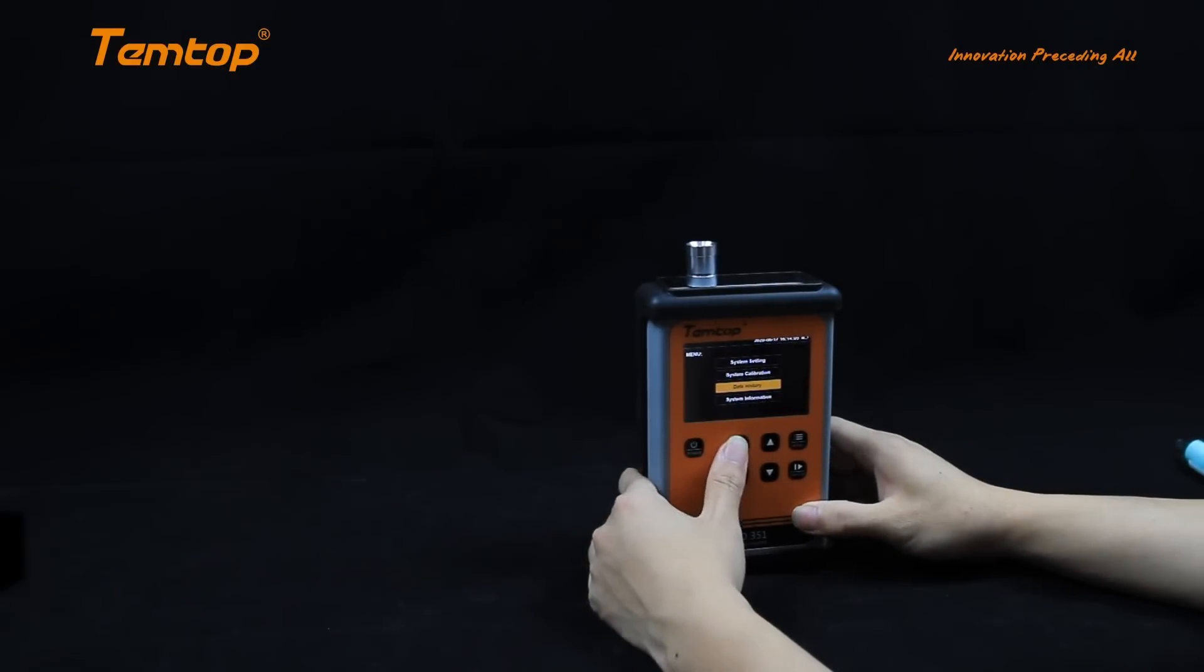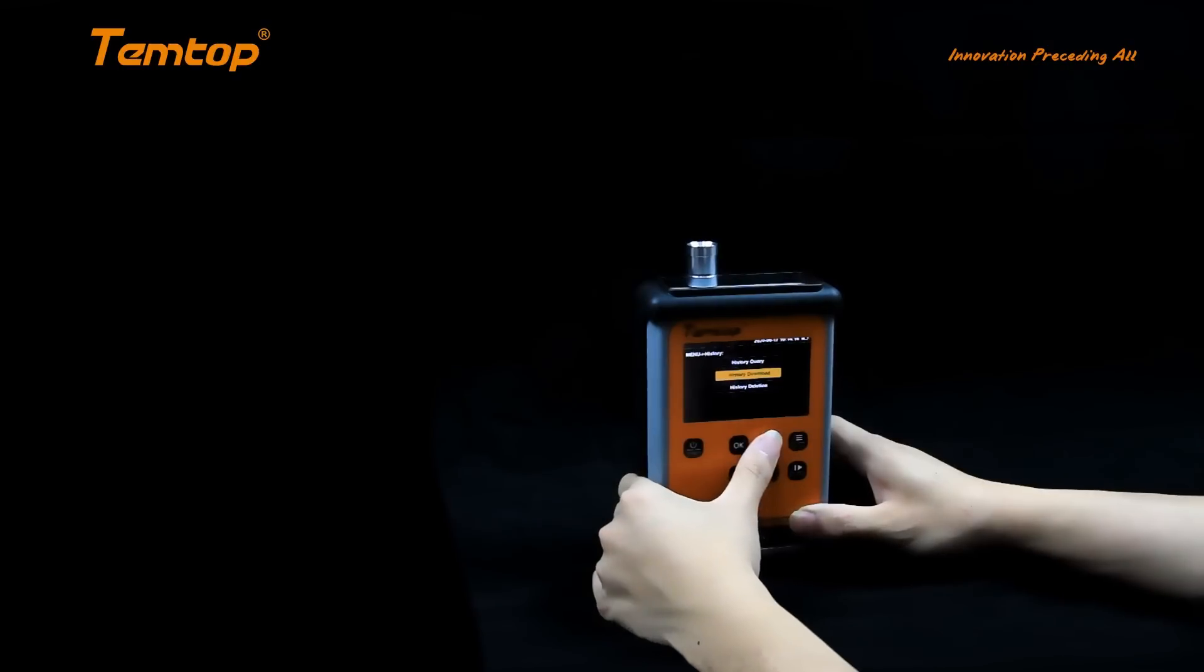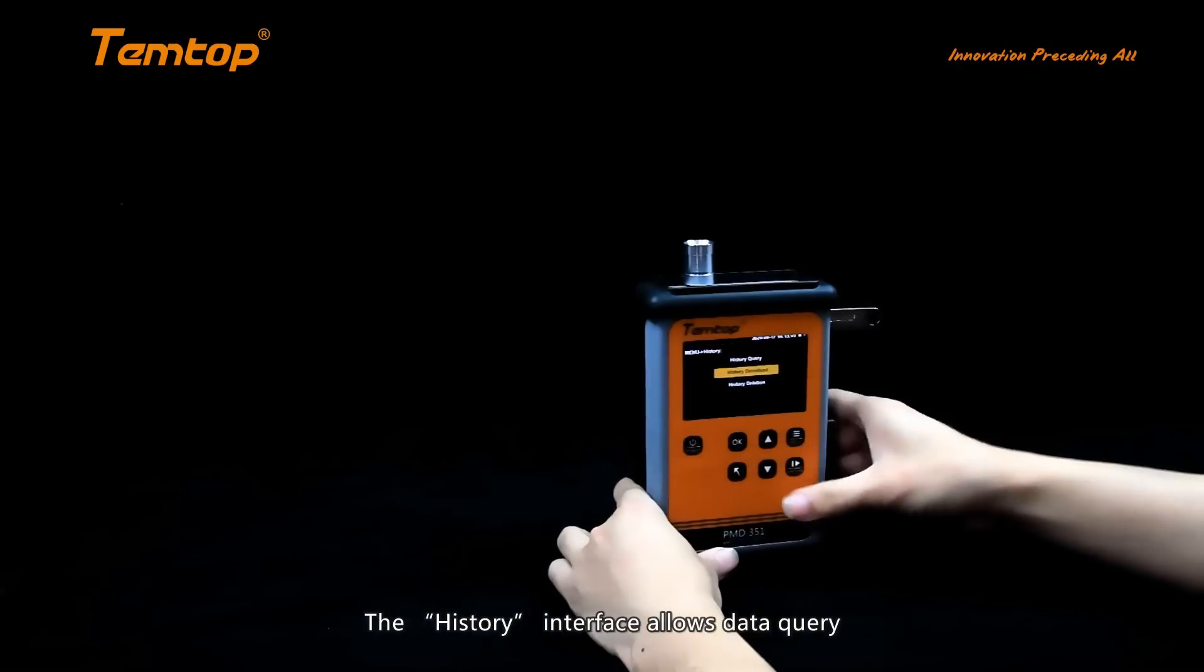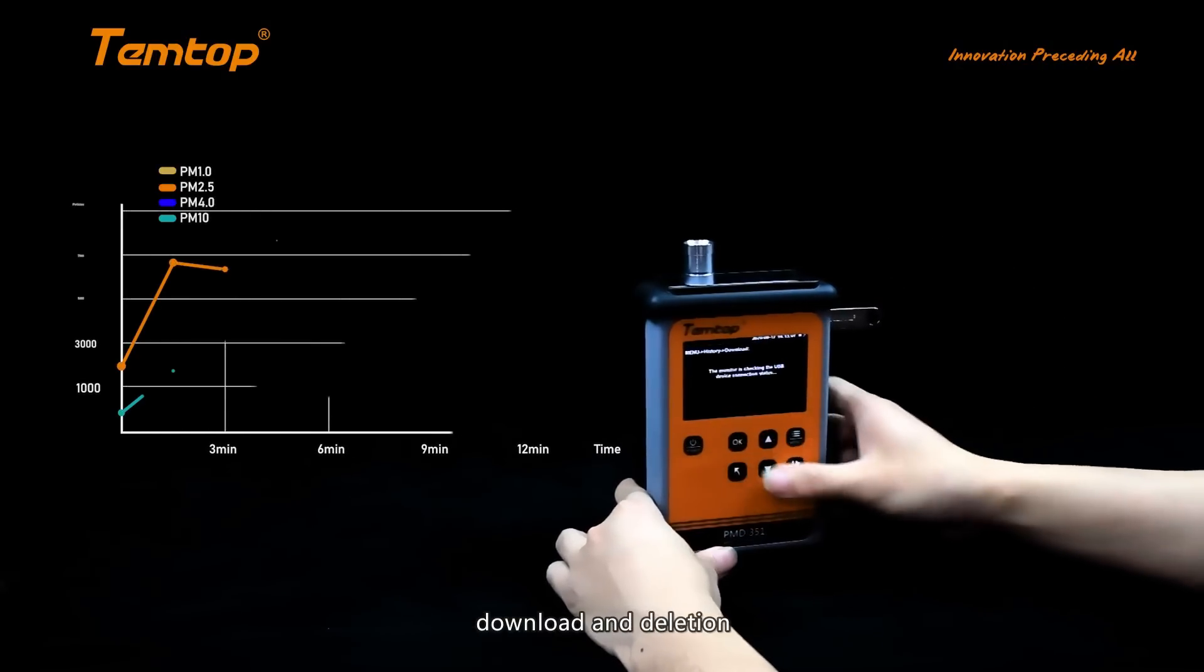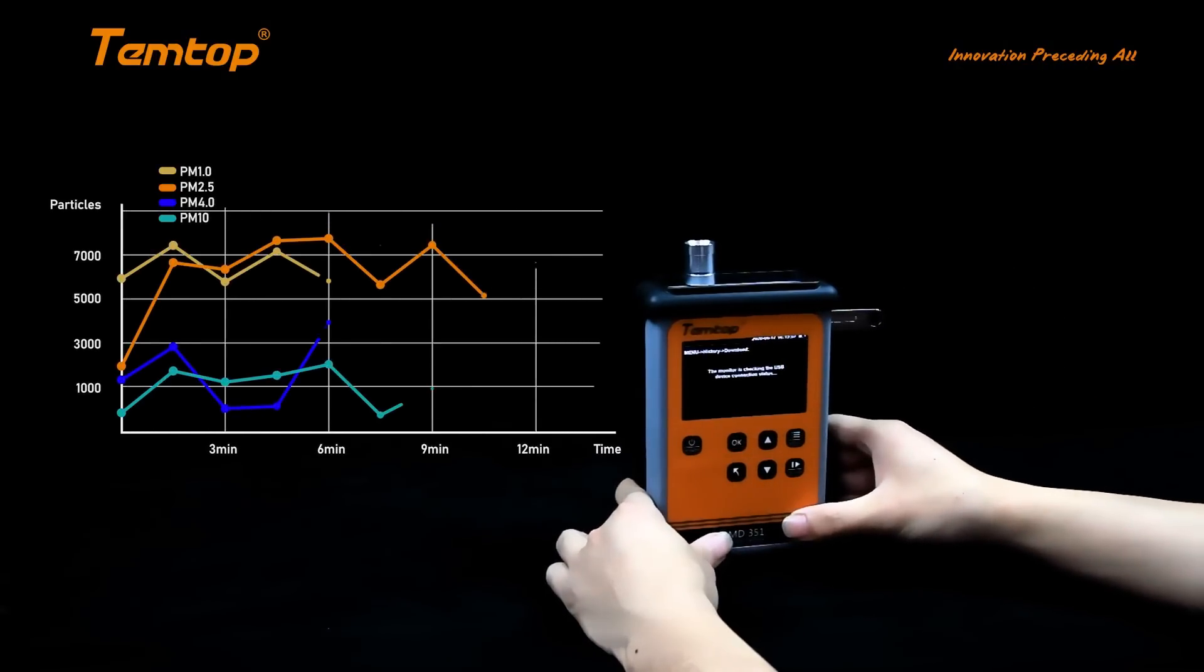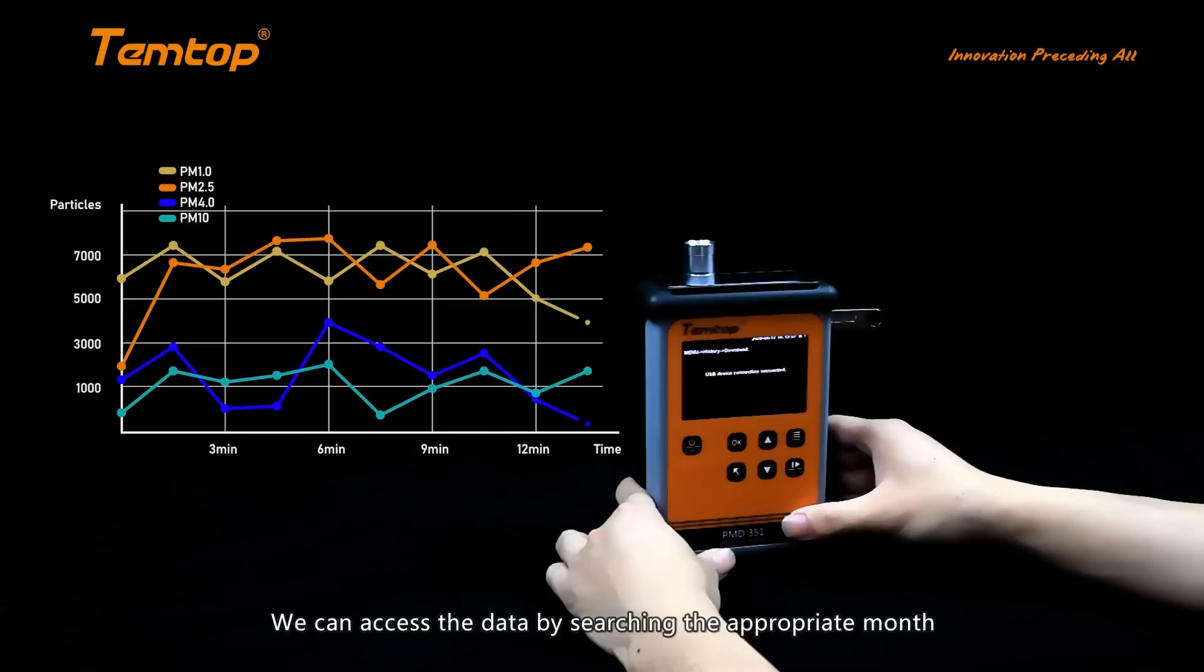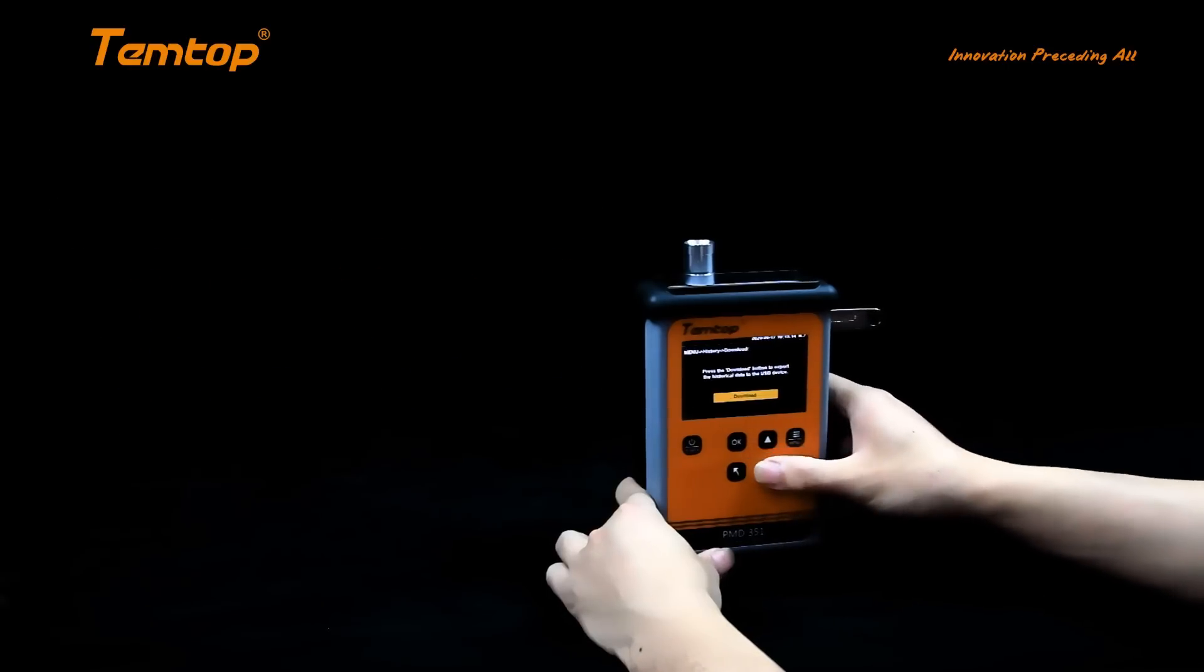The History interface allows data query, download and deletion. If you want to download the data, connect the flash drive and the device will check if the connection is ready. Then click Download to export the historical data to the flash drive.